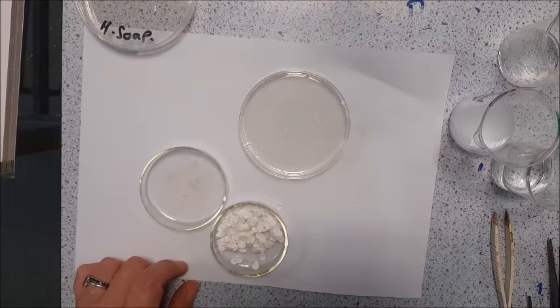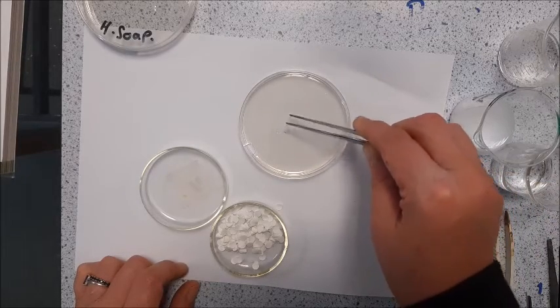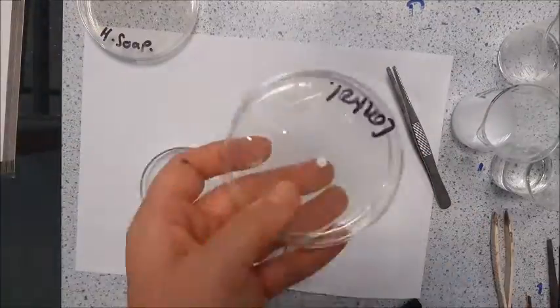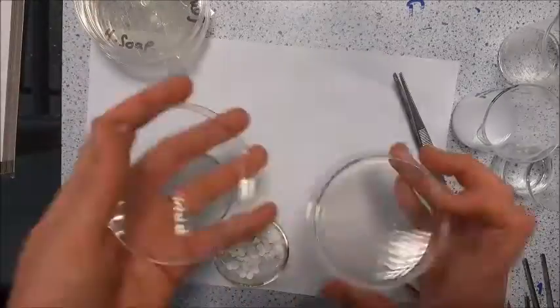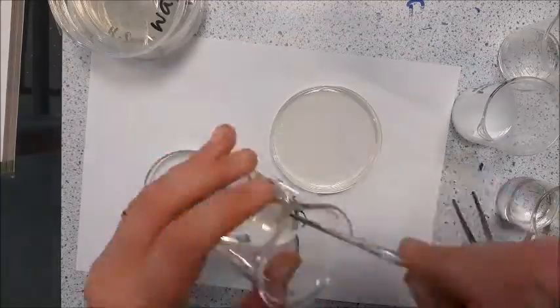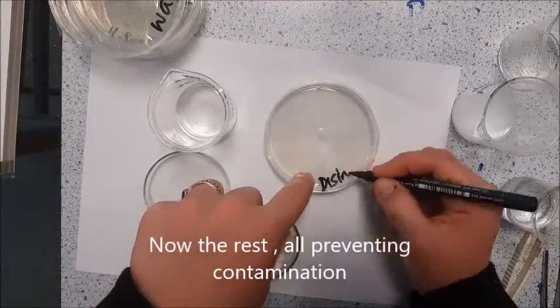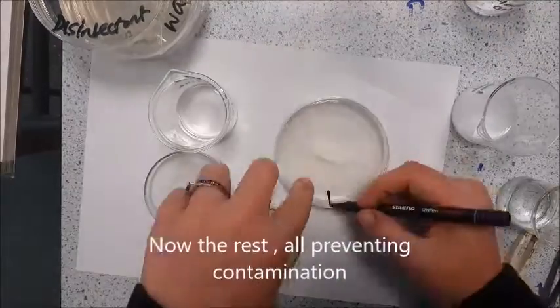And I'm going to leave this one with nothing — so this is going to be my control. Okay, so they're all done, they're all ready. They're going to go into incubation just so that I can see how the colonies develop. I'm going to check them every single day and then we're going to do the important maths.